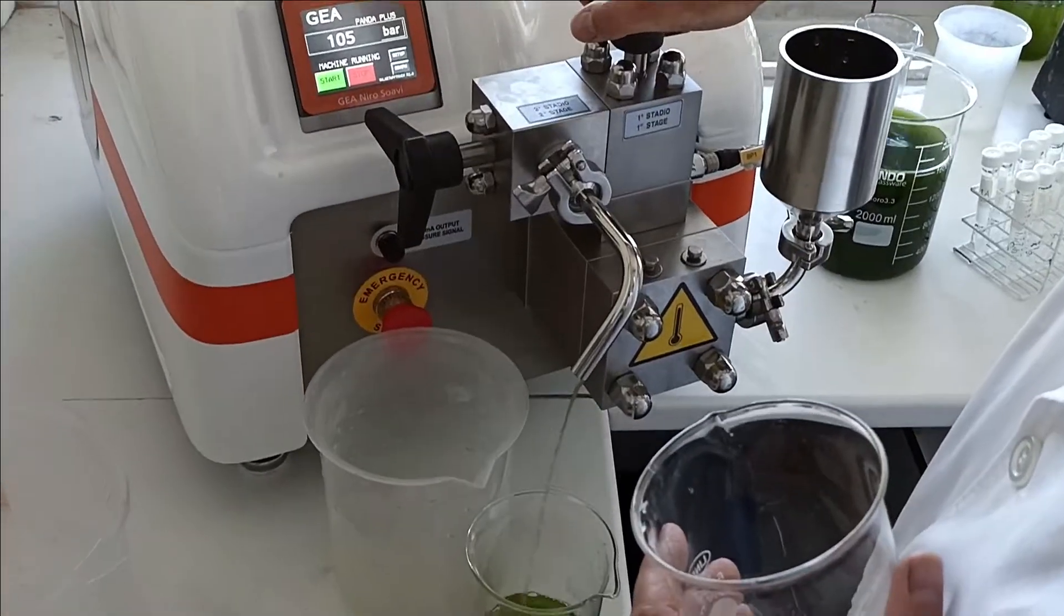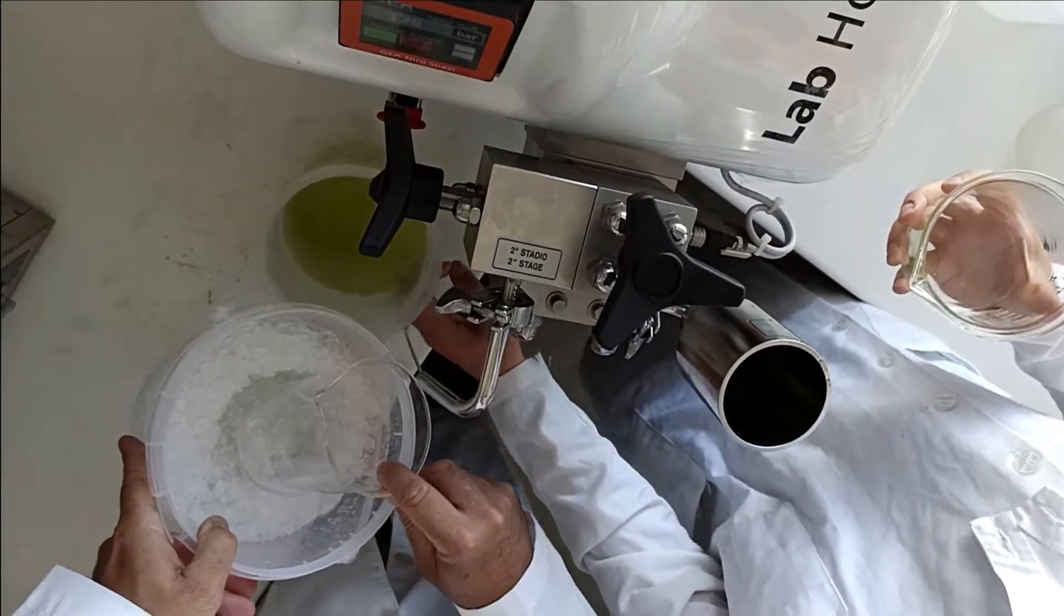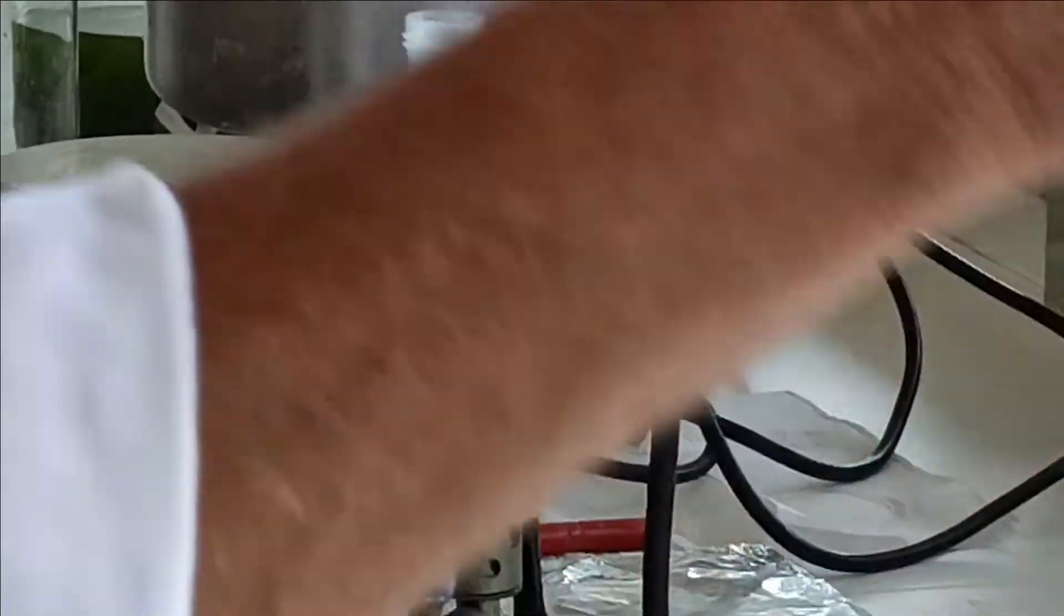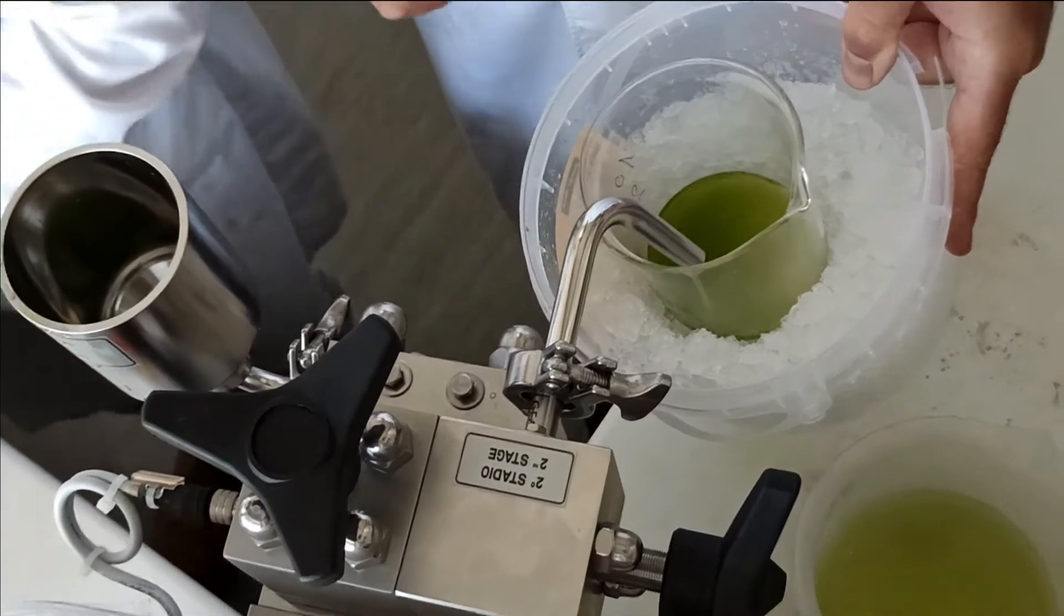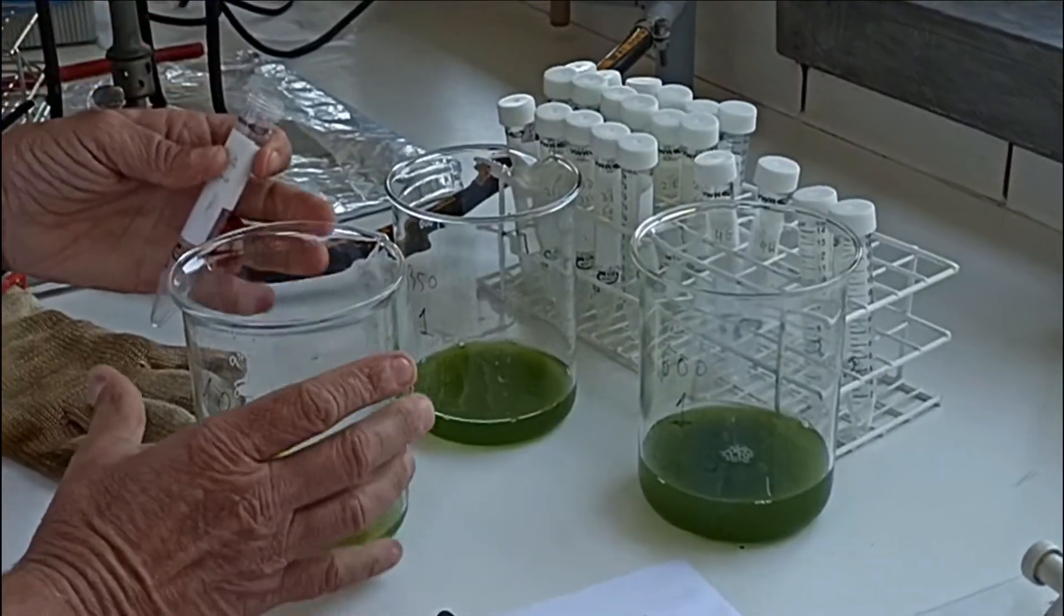After the pressure is stable and the culture is already flowing through the outlet, collect it. If you are only collecting one passage, you may use falcon tubes directly, or for instance, if you still want to apply other passages, consider using a bigger flask.